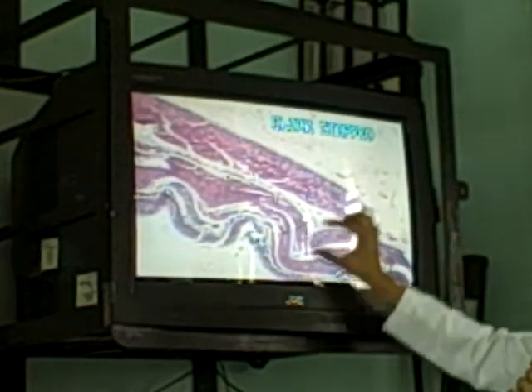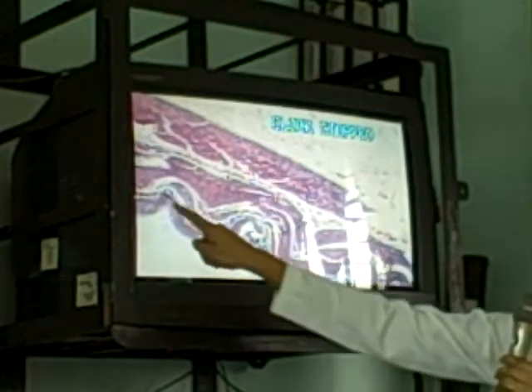That's lamina propria containing gastric glands. Submucosa, also you have blood vessels, no glands. Instead, you have Meissner's plexus, and then you go down. Go down, you have three layers. Three layers for the stomach: inner oblique, middle circular, and outer longitudinal. Okay? So, here's the oblique. This one is oblique, this one is circular, and this one is your longitudinal.